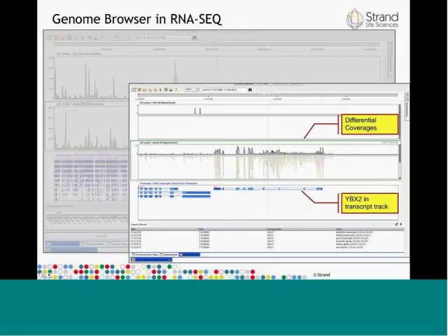It so happens that there are some reads and there is some coverage in intronic regions. And in an RNA-seq experiment, if you perform novel detection, it's likely that this region would be detected as a novel exon for this gene.